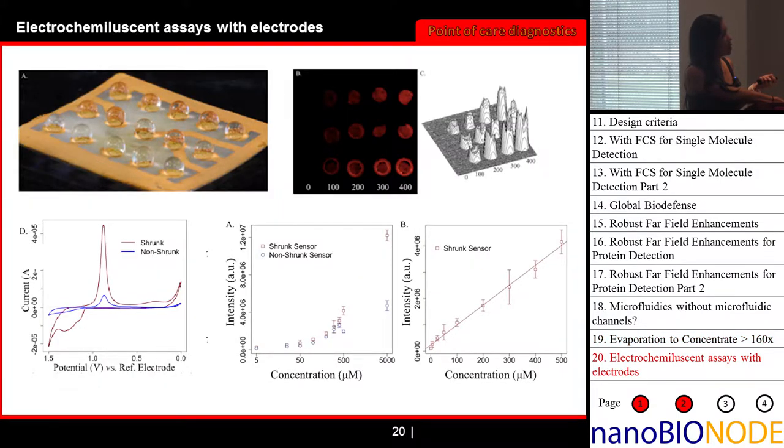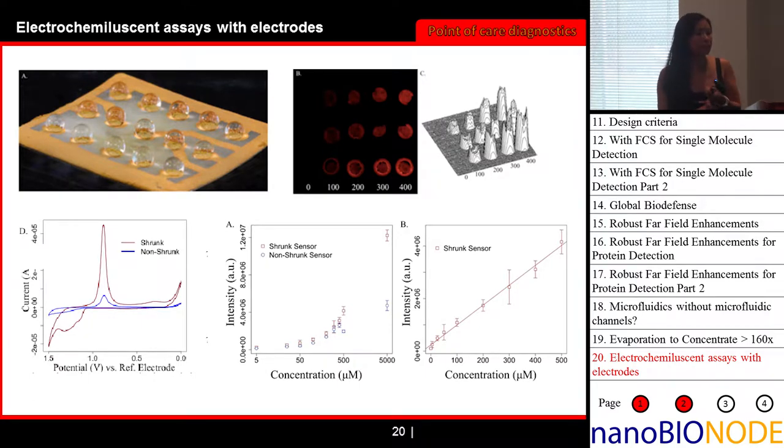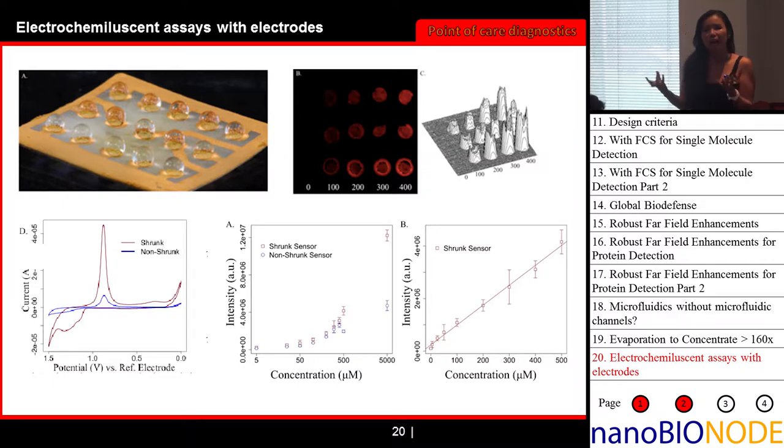So in terms of point of care, we also have been using these surfaces. We talked about nickel, we talked about nickel gold for the two-photon excitation, and we talked about these structures purely in plastic for superhydrophobic surfaces. But these also make great electrodes, right? You have these really high surface area electrodes that can be put into plastic, and you saw that they were robustly integrated into the plastic. So you can make really low-cost, high surface area electrodes for point-of-care applications that integrate into your microfluidic channels.